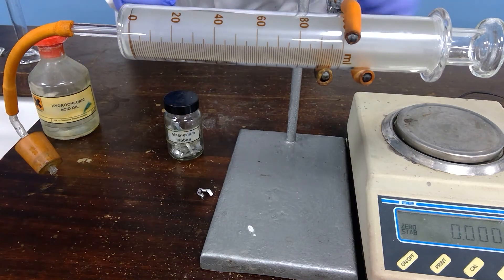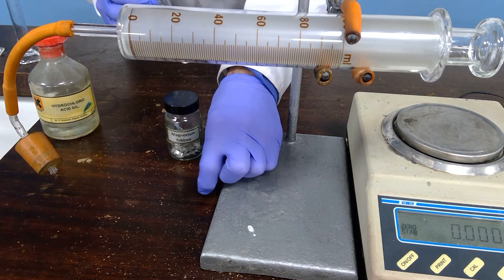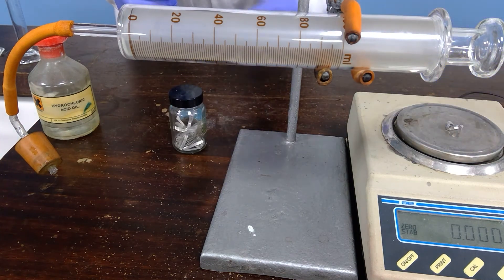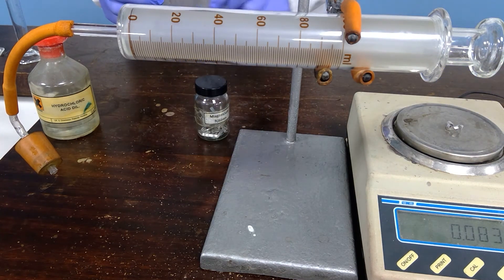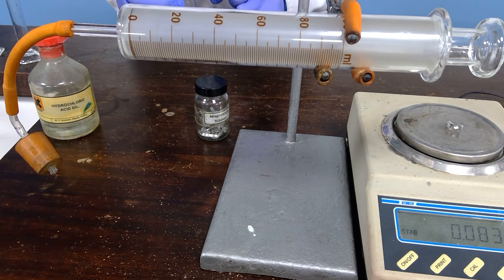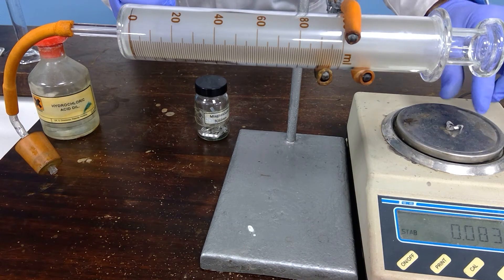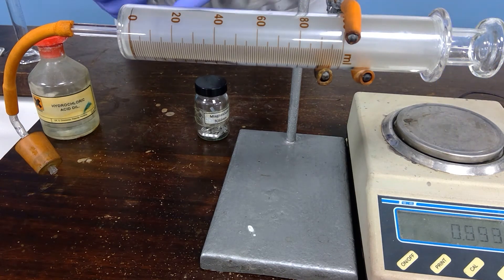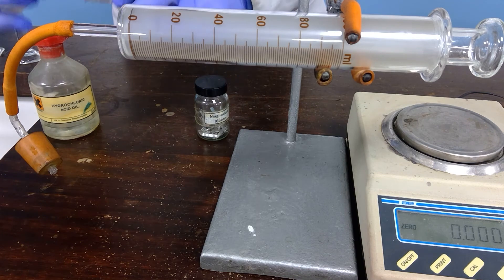And we work with the third one, checking that the balance is at zero. We take the mass of the third piece of magnesium. Okay, that is settled. And once again we place that into the top.